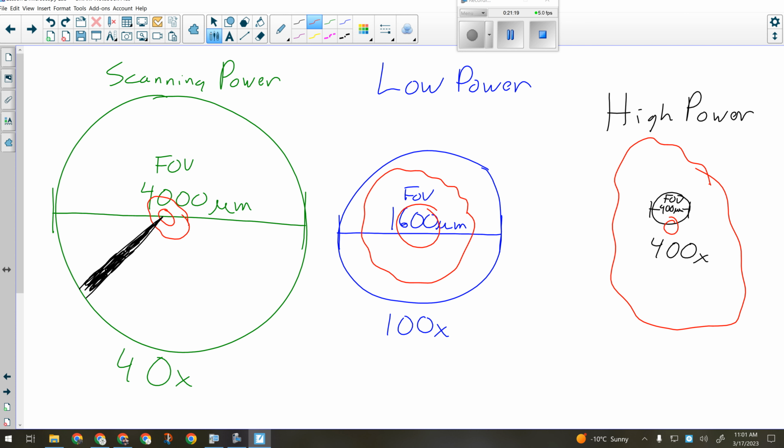Now, each time you get it good and in focus on the proper magnification, you're going to take your phone, put the camera up to it, and get a picture of it with your phone through the microscope. It takes a little while to get the hang of this. Okay, you can do it. It just takes a little bit of practice, but you can do it. Okay, so you'll do that. Everybody with me there? Okay. Then we're going to make lab diagrams.